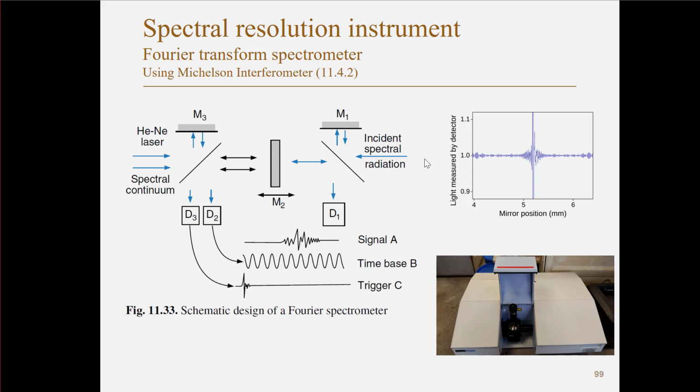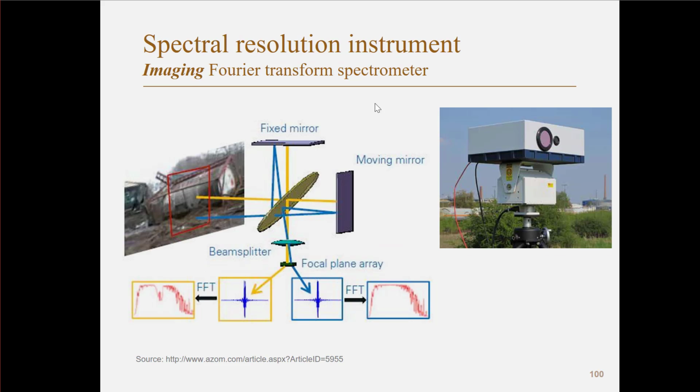And here is a picture of a Fourier transform spectrometer. They can of course look very different. This is an instrument used in chemical analysis, I think. But as we saw here, we had two different paths going through the interferometer, but you can actually also make it with many different paths. So you can make these Fourier transform spectrometers into spectrally resolving instruments.